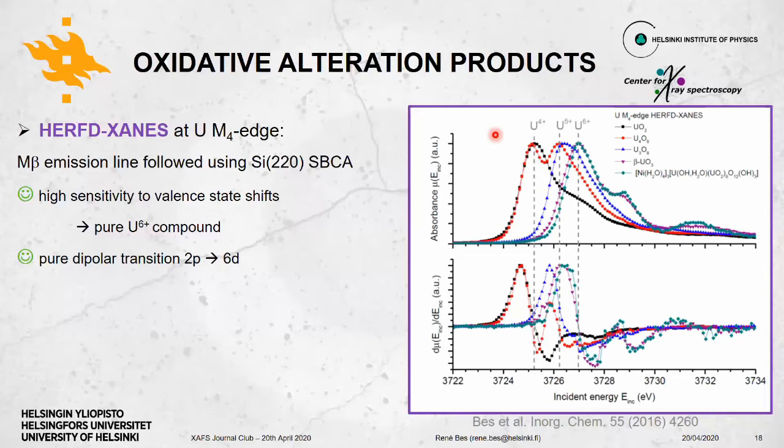It was actually the same one I showed before on the Mars beamline. And we had this time 2 crystal analyzers of silicon 220 and a standard detector. And for limiting the self-absorption, we used a helium-containing bag just in between.